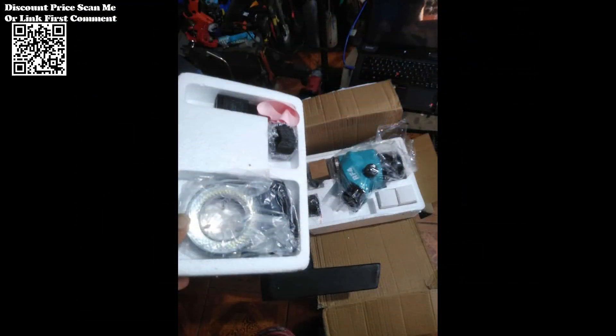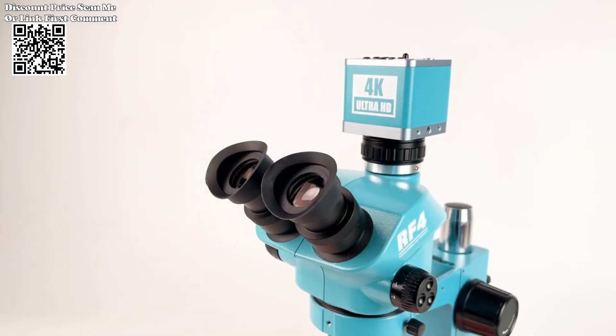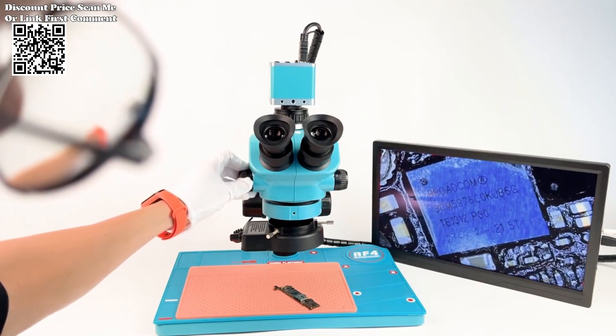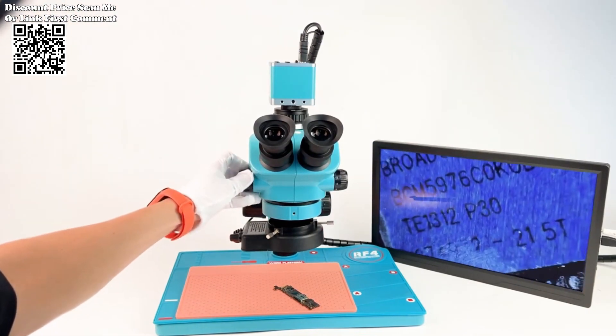Versatile Applications: From phone PCB soldering to scientific research and industrial inspection, this microscope is designed to meet the diverse needs of professionals across various fields. Whether you're conducting routine examinations or delving into advanced research, the RF4 microscope delivers unmatched performance and reliability.